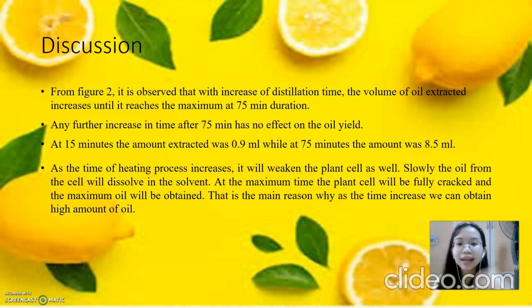This is because as the time of heating increases, it will weaken the plant cell, and then slowly the oil from the cell will dissolve in the solvent, and at the maximum time, the plant cell will be fully cracked and the maximum oil will be obtained.